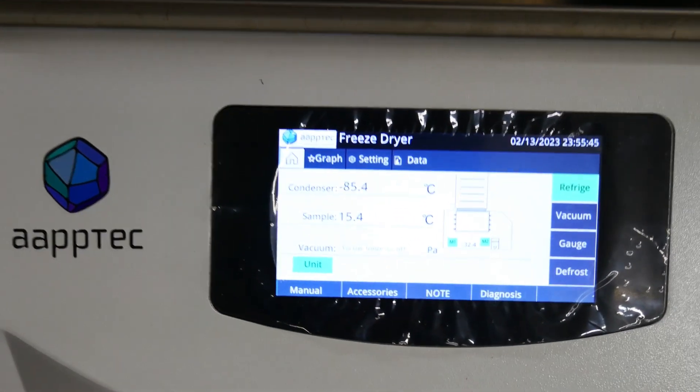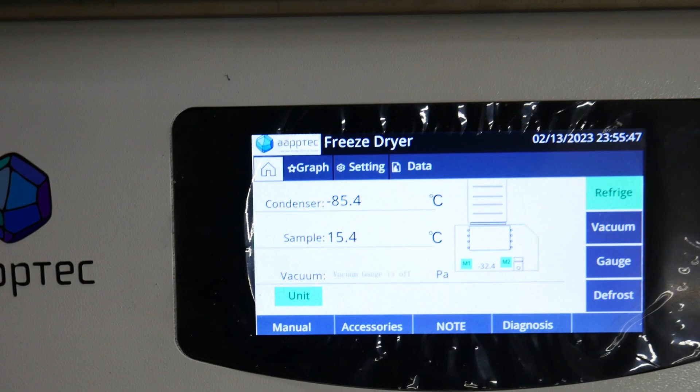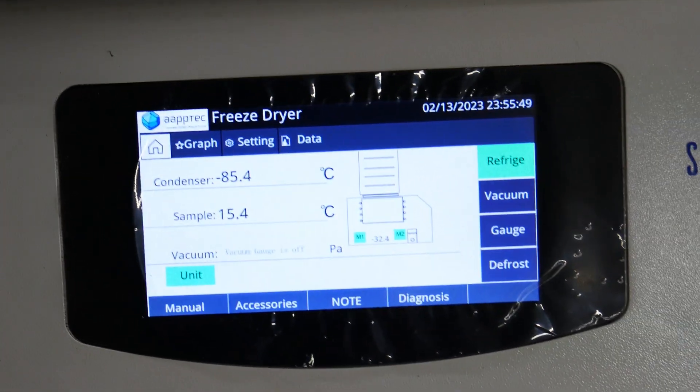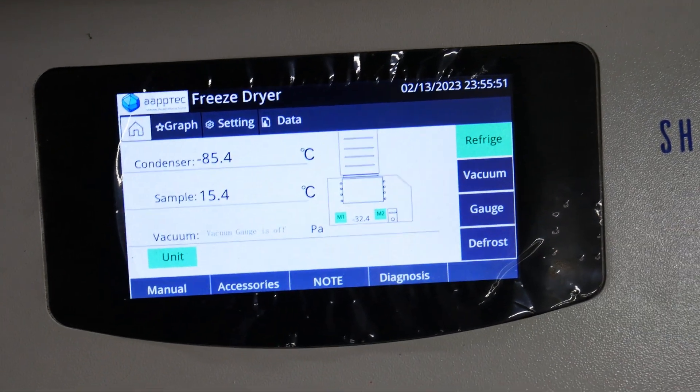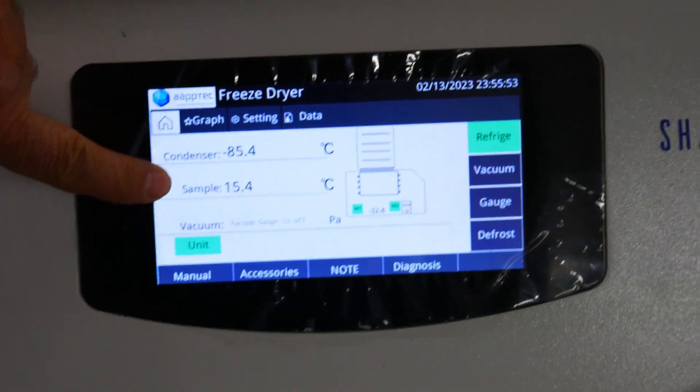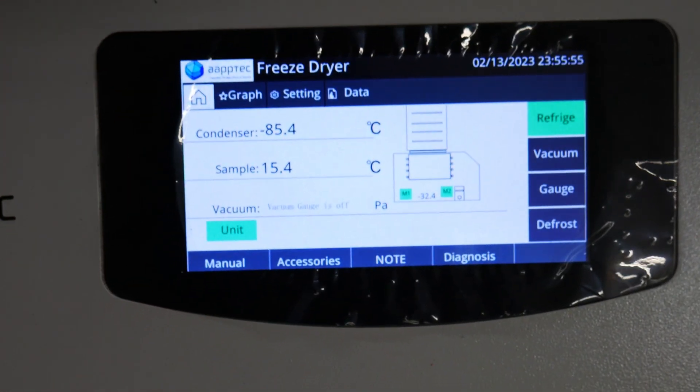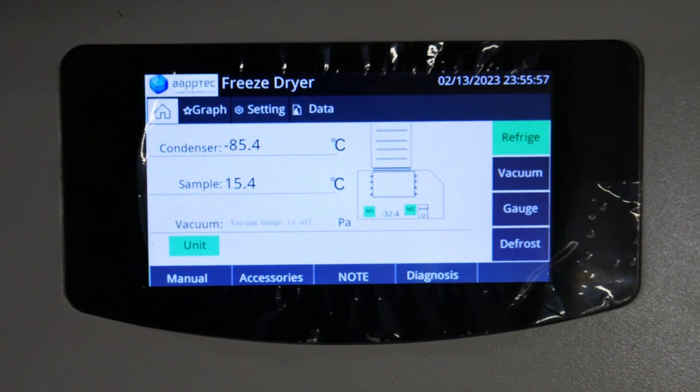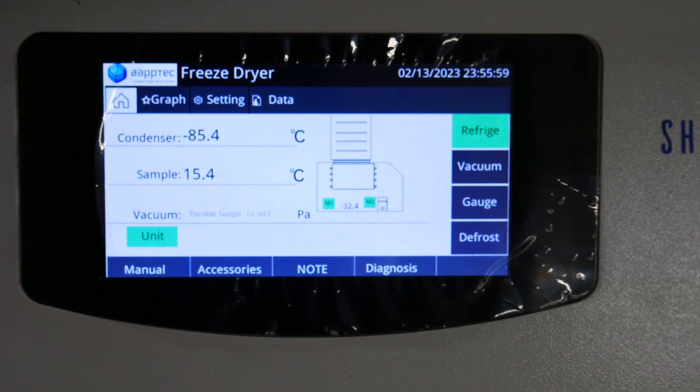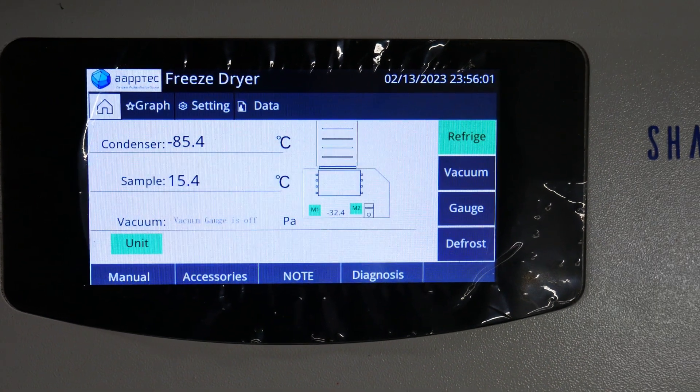The system is set up for minus 80 degrees, but you can see it shows minus 85 degrees. You also have a temperature sample which is sampling the temperature of the material or peptides inside the chamber. At the moment, it shows 15.4 degrees.